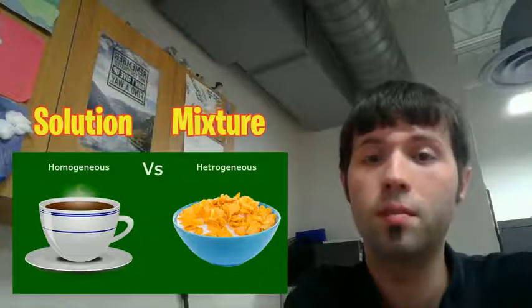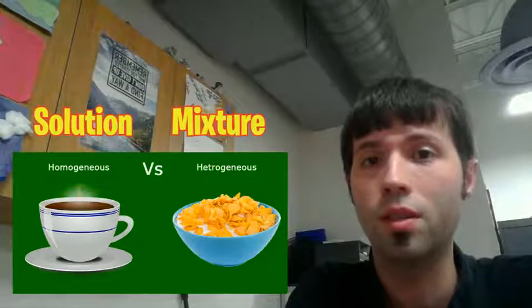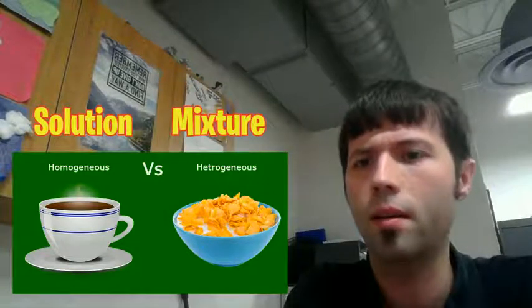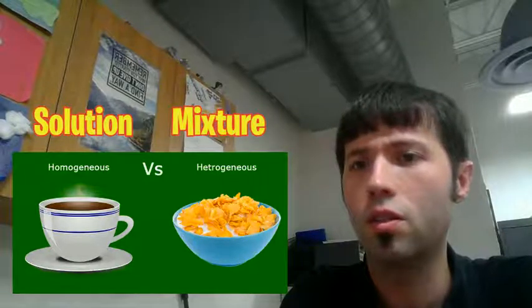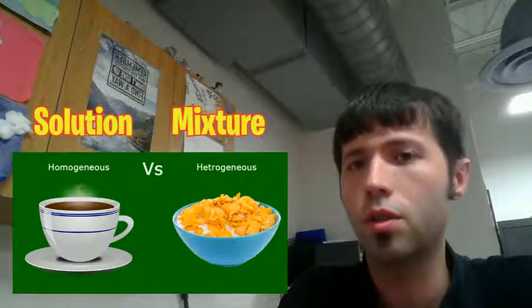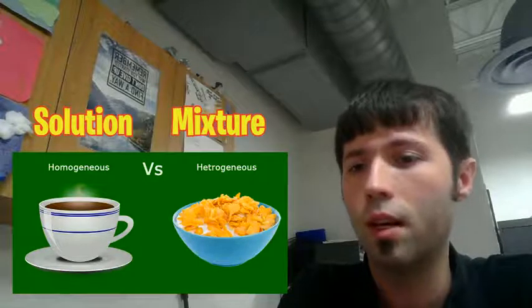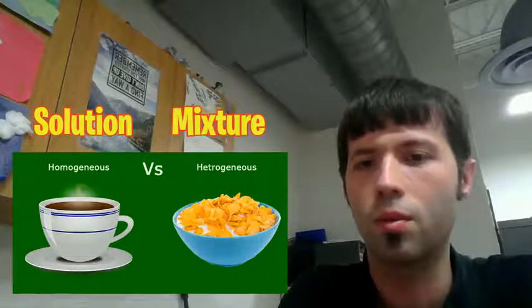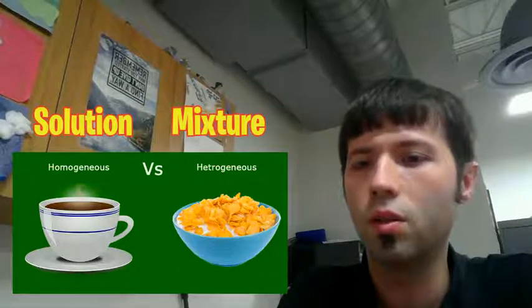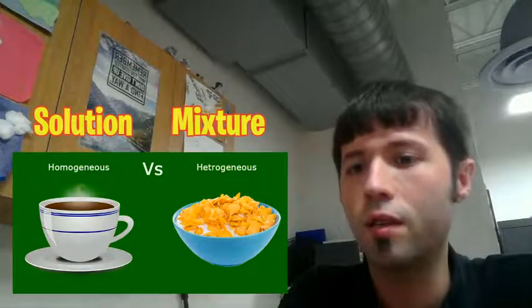Hello, chemical systems. So today we're going to do an experiment on the solubility of salt. Before I get into that, let me review a few things. Yesterday, you learned about solutes, solutions, and solvents, which I'll review again in just a little bit. But I wanted to make sure you understand the distinction between a solution and a mixture in chemistry. A solution is something where something is completely dissolved.